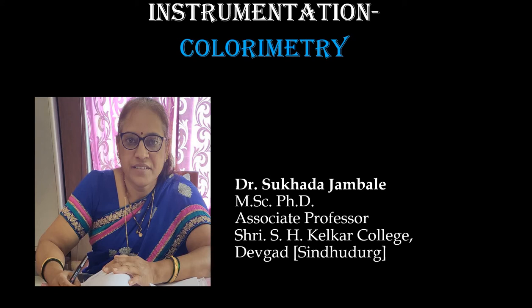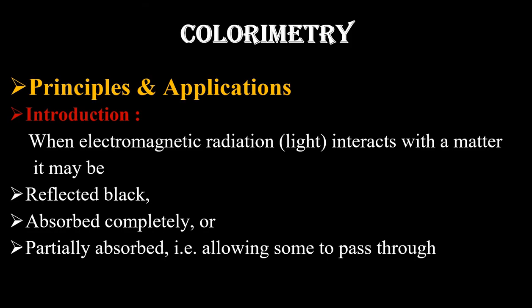Next point from our previous chapter, that is instrumentation, which is colorimetry. We'll discuss the same in this lecture with respect to two points: introduction, and then principle and application. First we'll consider the introduction point of the colorimetry instrument.